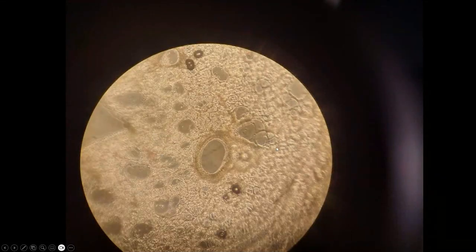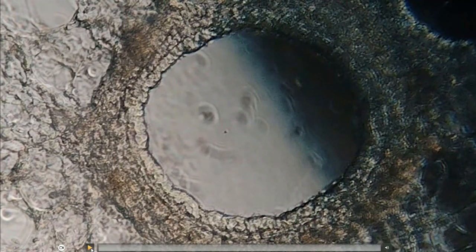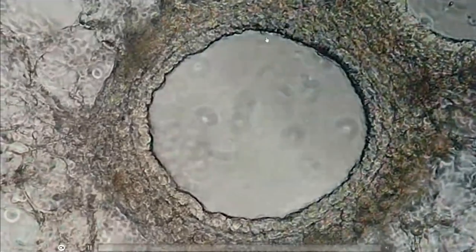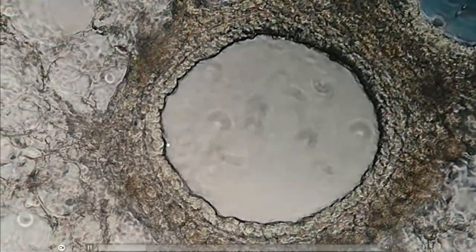So here we have a nice smooth muscle ring, and again, you can possibly see an epithelial layer inside. And what I'm going to click, hopefully I can click, you can see if I click this video, what I want you to look at is the cilia. So I'm going to start this video. Do you see all these cilia here along the interior of the slice?